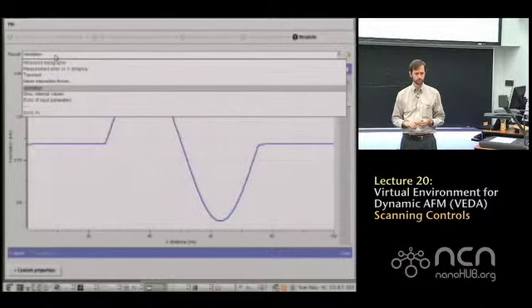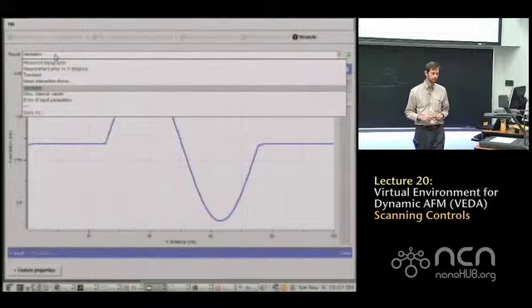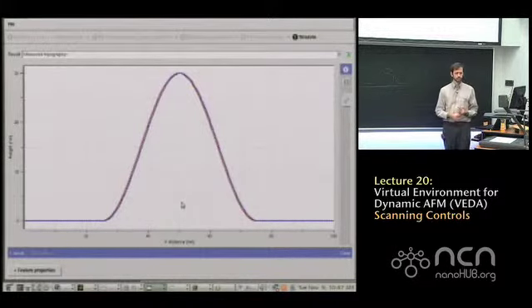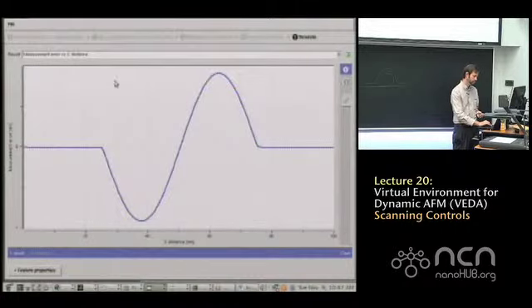This example shows a very interesting phenomenon. The width of the feature was roughly 40 nanometers. And you look at the topography and it looks very reasonable, but you look at the error, just go to the error map, and you notice that the error is basically not zero everywhere, which means it's a very narrow object, 40 nanometers.